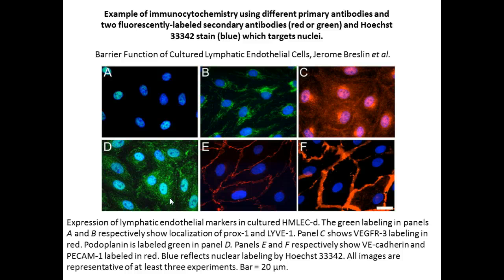So we don't only know it's there, we know where it is, right? Microscopically, they're looking at it on these cells and they're like, oh, look, this molecule is probably associated maybe with the membrane, it seems like, right? Where this is inside the cells, right? Who cares what the molecules are? I don't even have a clue.